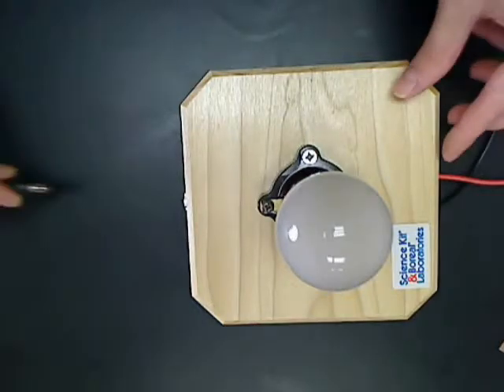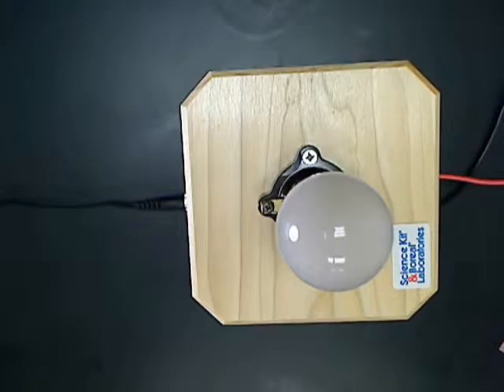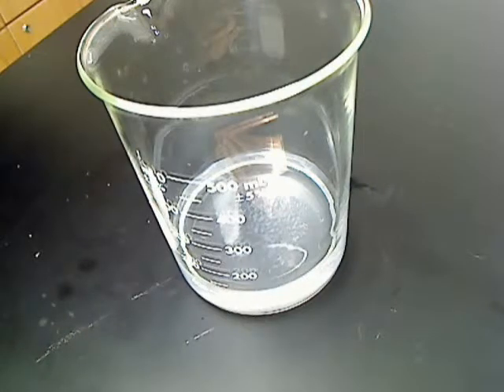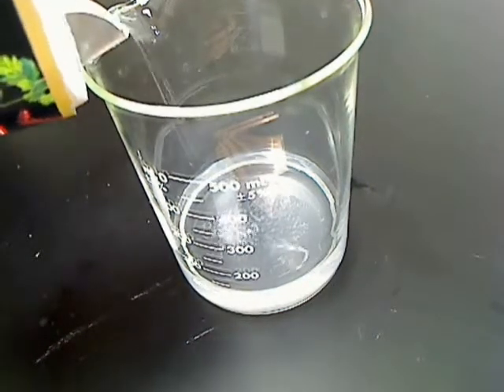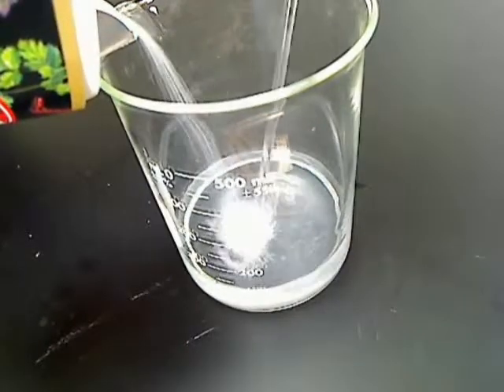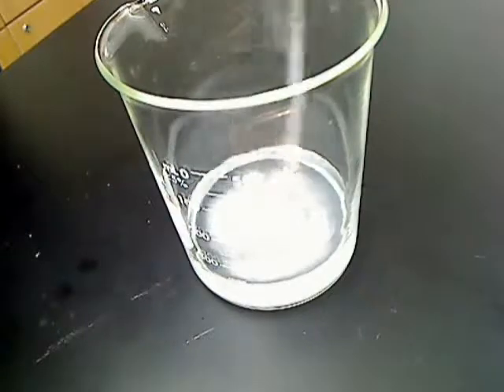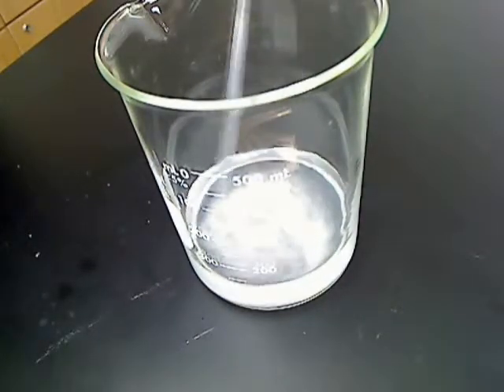To begin, plug the universal adapter into the wall socket and into the inline power jack on the conductivity indicator. Next, prepare a 100 ml sample of the liquid you want to test. Here I will be preparing a salt water solution by dissolving sodium chloride in water. This is a strong electrolyte because it completely ionizes in the solution.